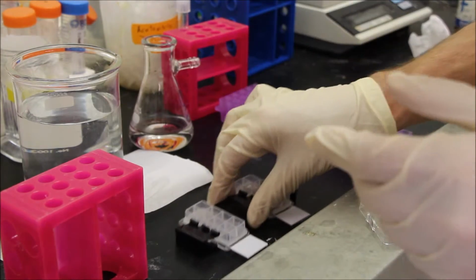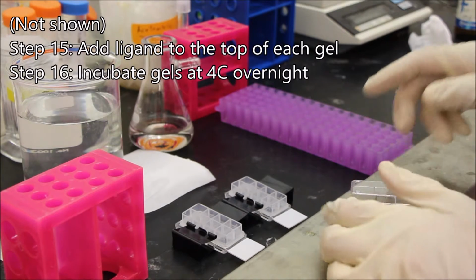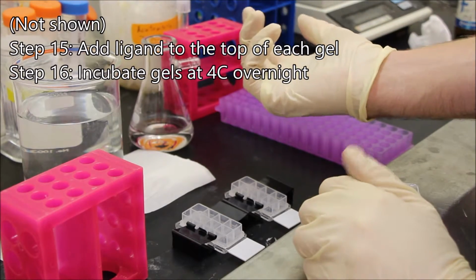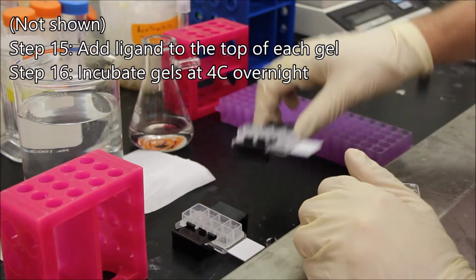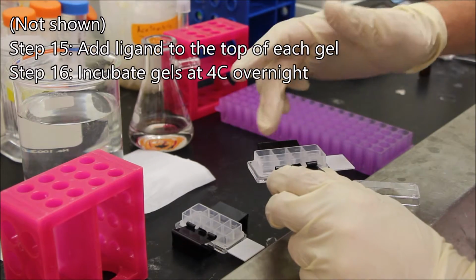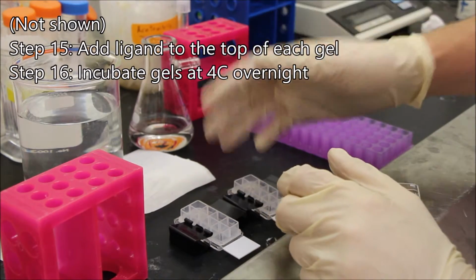And down. And so now quickly, the NHS group is slowly but surely hydrolyzing here. I would now take 200 microliters of my 0.1 millimolar peptide solution and pipette that into each of these wells. So there'd be 200 microliters of peptide solution or your protein of interest in each of these wells, and I would just bring these and incubate them at 4 degrees C overnight.